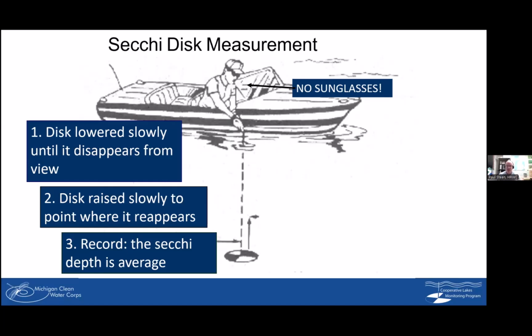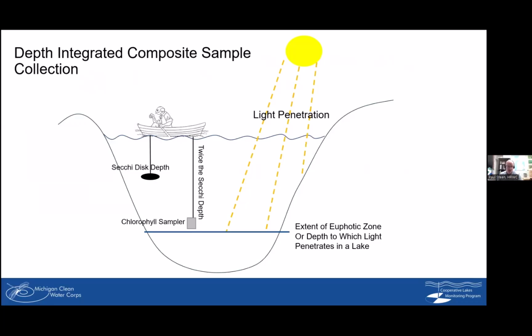Do it in the shady side of the boat if there is shade out there for you. I guess that's all I have to say about that. So that's step one, getting the Secchi disc measurement.